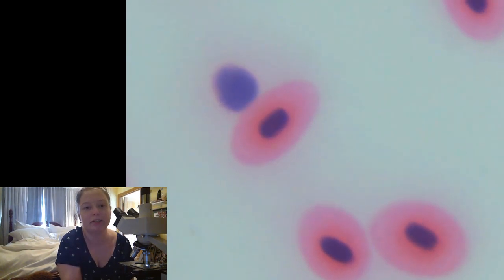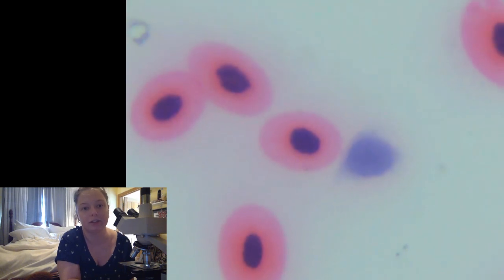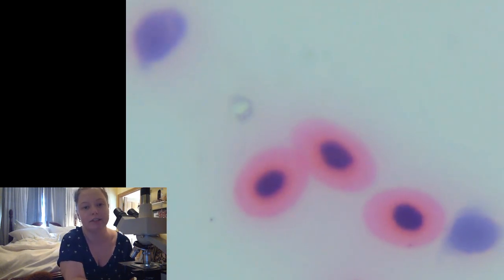Like when you look at bacteria on the slides, which we will probably do in a couple weeks if I keep doing live streams, bacteria aren't actually those colors. It's just we use different stains. Yeah, those are probably nuclei, which is interesting because human red blood cells don't have nuclei. So that's really an interesting thing to see there.